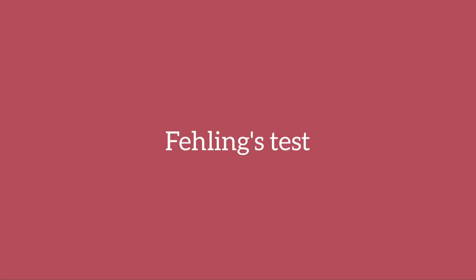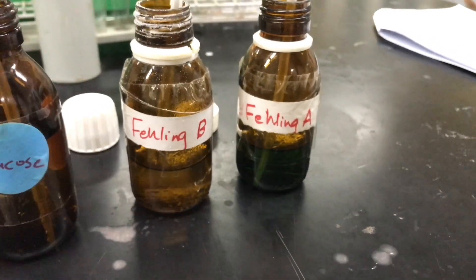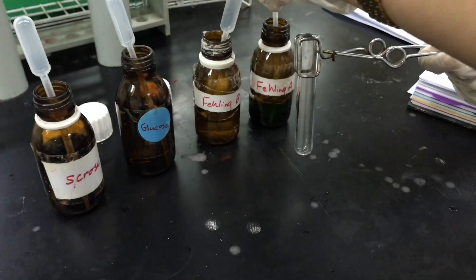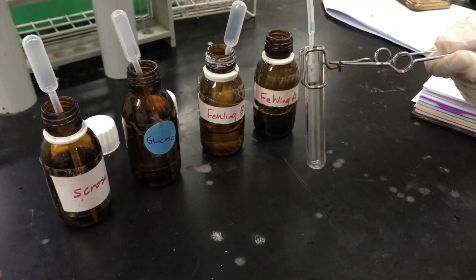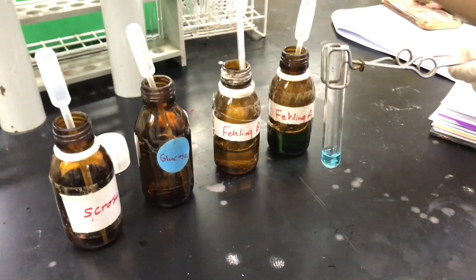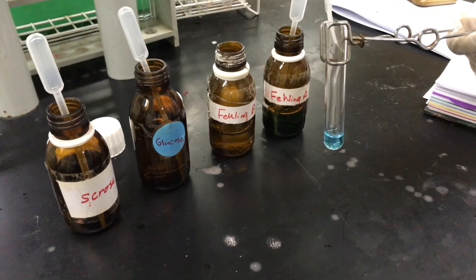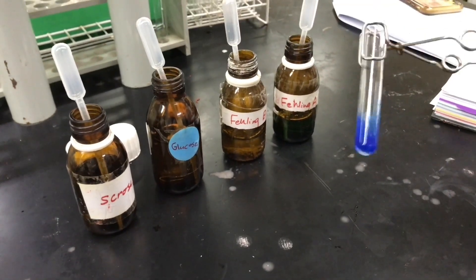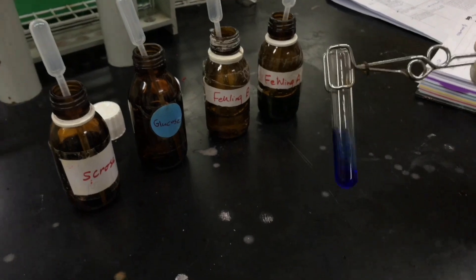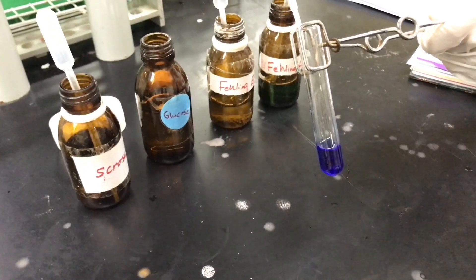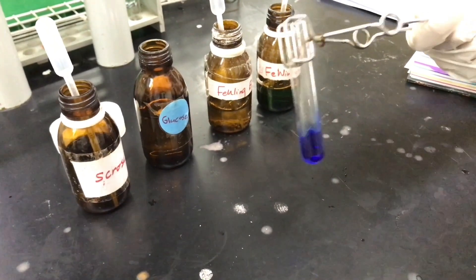Moving on to Fehling's test, which is going to show us the presence of reducing sugar. You're going to need Fehling A and Fehling B solutions, as well as a non-reducing sugar like sucrose and a reducing sugar like glucose. Add one mil of Fehling A solution, then one mil of Fehling B solution — make sure that the amounts are equal. Shake well, then add a few drops of glucose, which is a reducing sugar, and shake well.